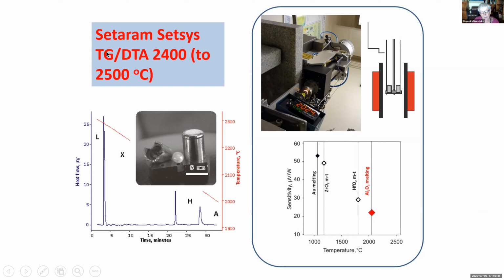We initially thought that we could use yttrium oxide, which melts at about 2300 degrees, as a standard, but the heat of fusion, which we thought we knew, did not make sense in terms of the calorimetry, and that was actually one of the impetus for our drop and catch calorimeter that I will get back to. So anyway, we basically seal our sample in a tungsten crucible and effectively then heat it up in what is, in a sense, a normal DTA.